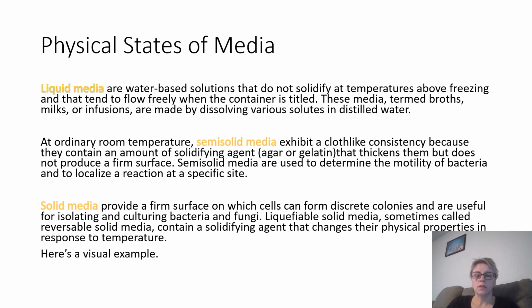Liquefiable solid media, sometimes called reversible solid media, contain a solidifying agent that changes their physical properties in response to temperature.